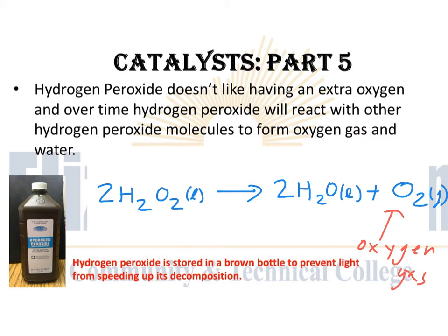There are also chemical catalysts that can speed up this chemical reaction, and that's what we're going to look at in today's experiment. We're actually going to use a biological catalyst, or an enzyme, to speed up the decomposition of hydrogen peroxide. Make a note of Horton. H-O-R-T-O-N.